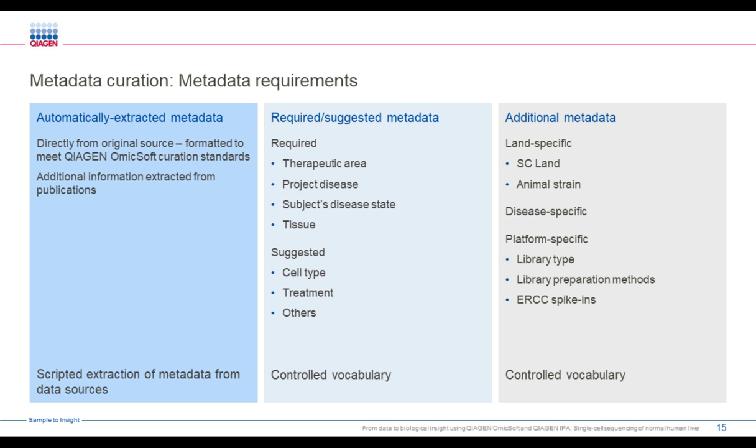There is additional manual curation based on the disease therapeutic area and more focused disease, each individual subject, disease state, and the tissue from which the data came. In addition, as available, any recommended metadata such as cell type identities, treatment status, and so forth are also applied to the individual samples and are all applied with a controlled vocabulary.